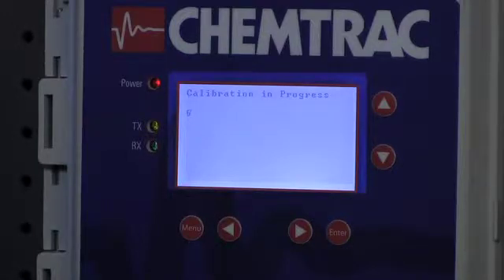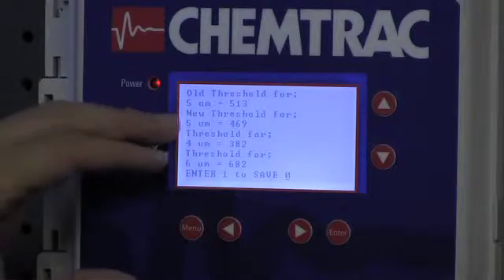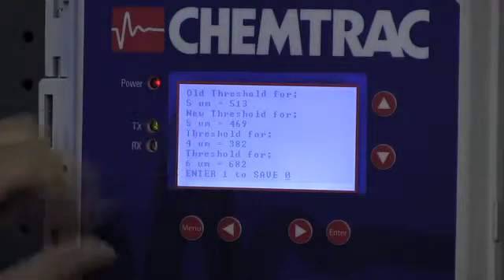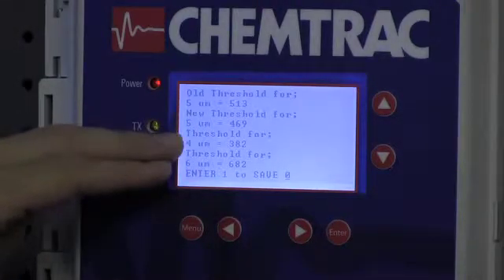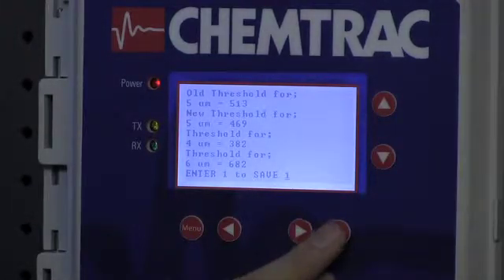Once again, it'll take about 10 to 15 seconds. It's going to show us our old threshold value of 513, our new threshold value of 469, and our neighboring thresholds. So to accept that, we change it to 1, and hit enter to save.